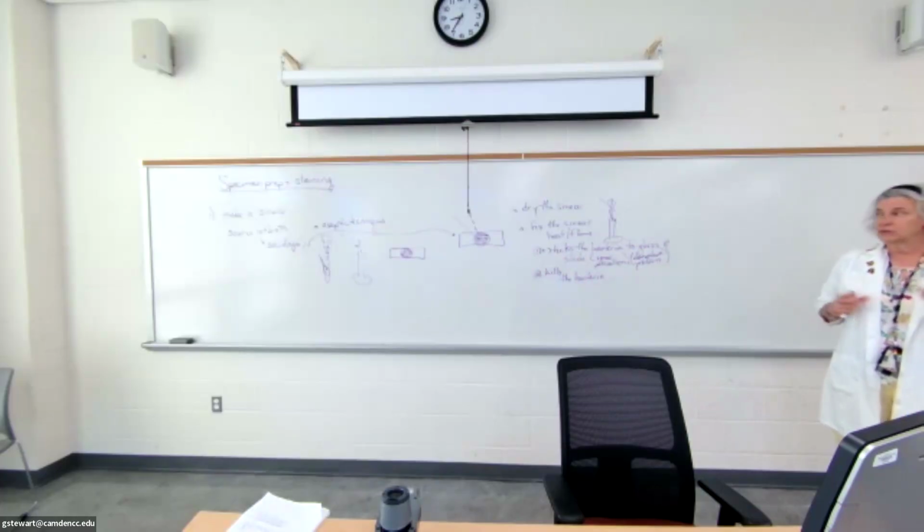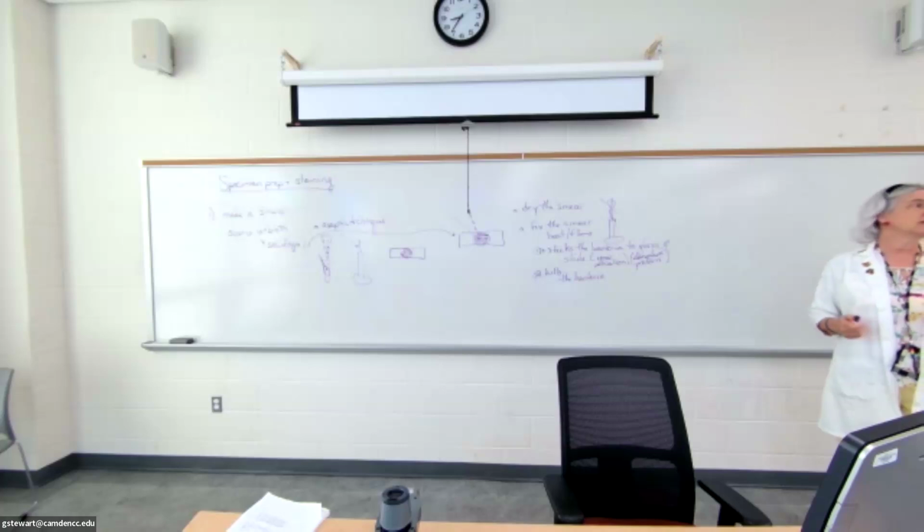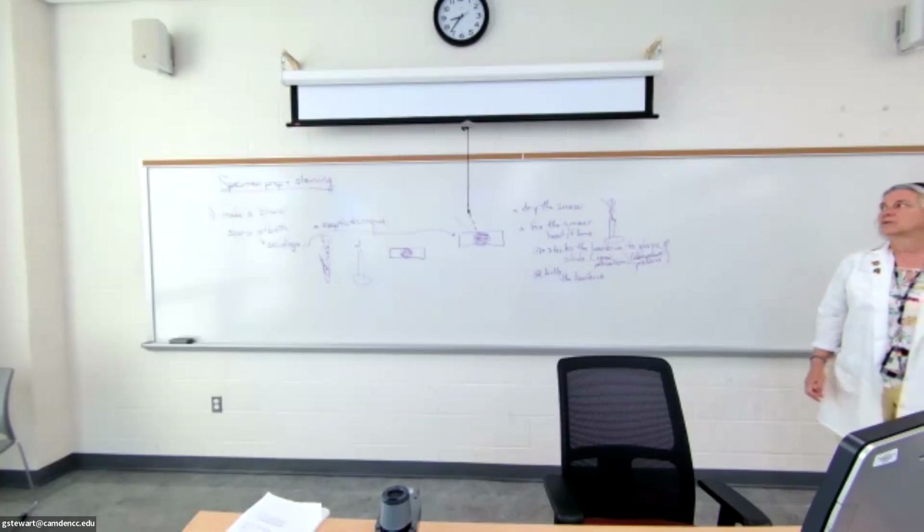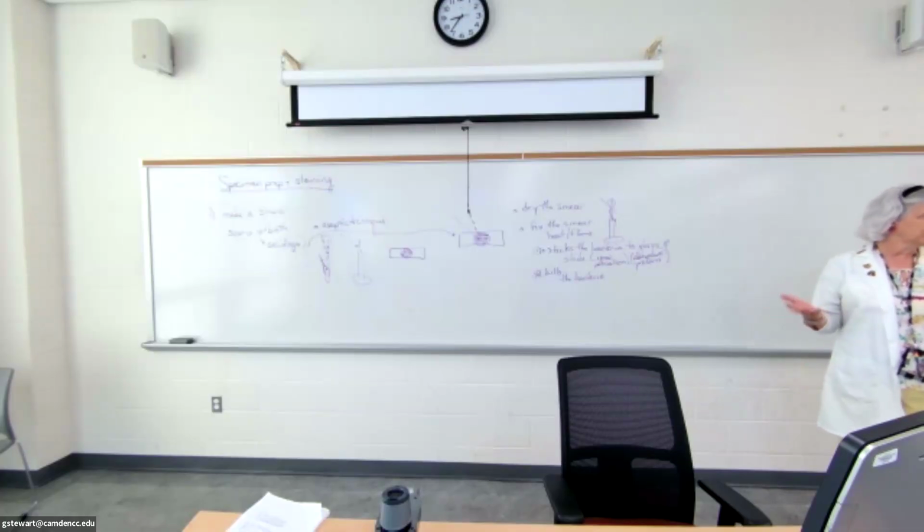I'm sure you remember I told you, maybe not, because it was sort of toward the end. If you forget to fix, which you didn't on Tuesday because I was reminding you constantly, but you might forget today, I'll probably shout it out a few times in lab, but certainly by next Tuesday, right? It might slip your mind. If you don't fix when you put the stain on, the bacteria is going to stick more to the stain than to the glass. And so when you wash with water, which is also polar covalent, it's going to take those bacteria and the stain and put them all in the staining pan. And you will have little to nothing to look at on your slide. Okay. So fixing, I can't emphasize enough how important the fixing step is.